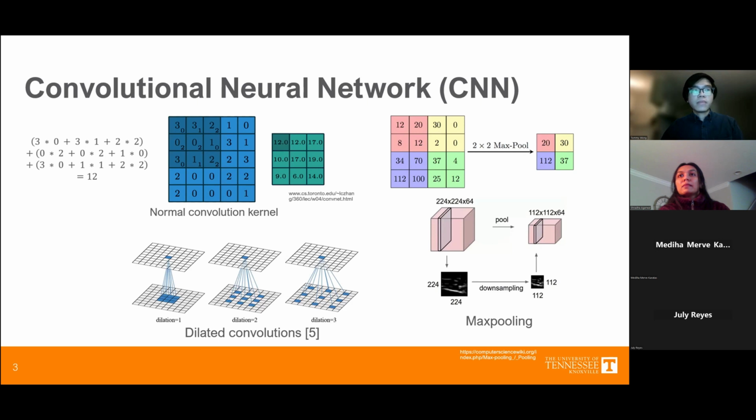So from there you could train the weights in that kernel, and then to actually optimize that network and to compute the loss, you will also use cross entropy functions too, but that cross entropy function would be operated over the image instead of a flattened version of that image.